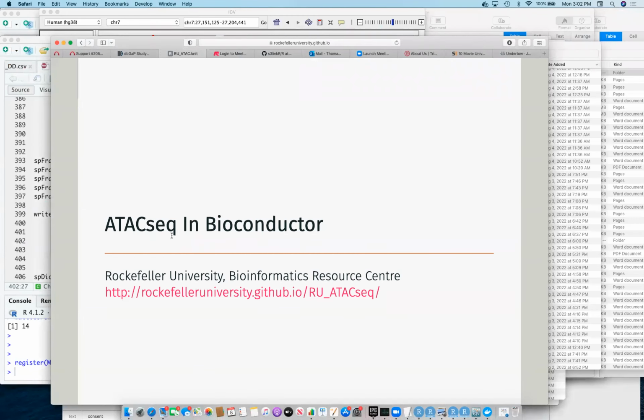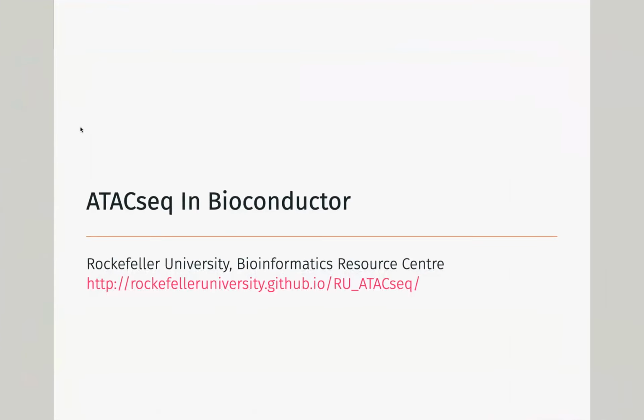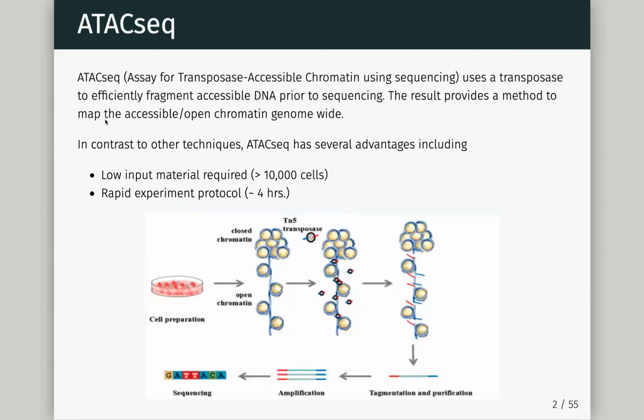Anyway, I took a lot of the public data. So I took the original ATAC-seq data, picked a little bit from Christina Leslie again, and we took some of her data again, just so that we can get a good idea what the original ATAC-seq looked like, what the modern day ATAC-seq looks like, and really dig down into low level looking at these metrics. So that's what we're going to cover today. I've split it up into 3 or 4 sections. A lot of this we've already covered, the basics, but now we're applying it, so hopefully we can put it into some context.